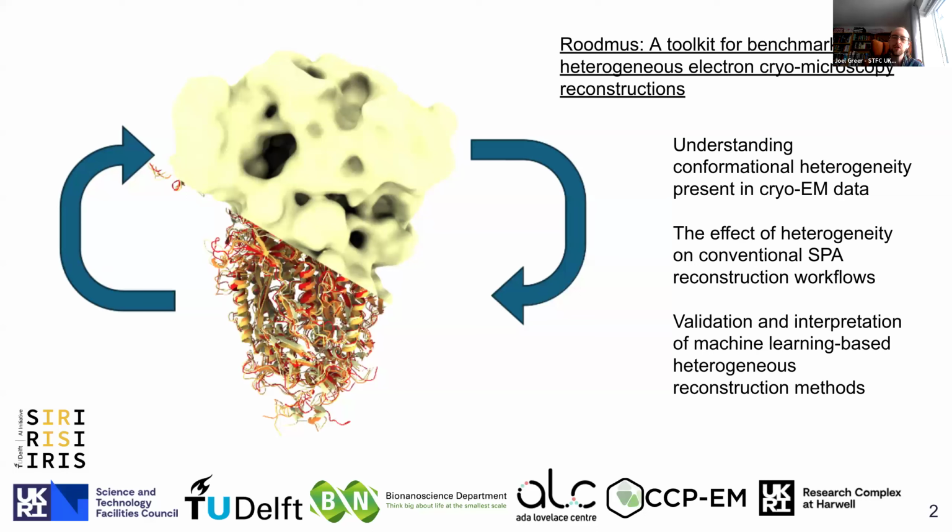In particular, we've been working to build up an approach which allows in silico simulation of cryo-EM datasets, whereby utilising the associated ground truth information from these datasets, we're able to study not only how heterogeneity is dealt with by conventional single particle analysis reconstruction workflows, but also how successfully algorithms which are designed to learn a representation of the heterogeneity present in a cryo-EM dataset are able to actually do so.